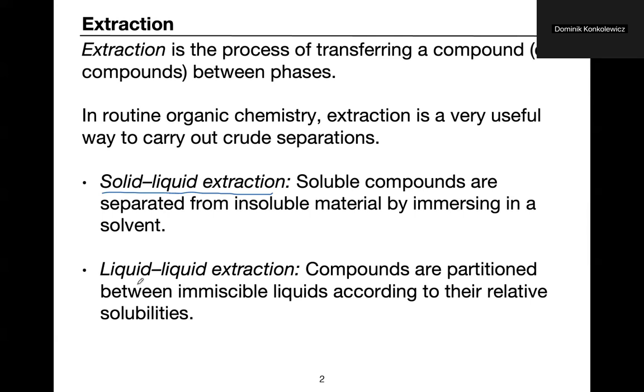No matter how much you try, if you take some kind of oil, so olive oil, or canola oil, or butter, or any other oil type product, and you try to mix it with water, it just won't mix, okay, because they're immiscible. In that case, we have two liquid phases that are distinct, an oil phase and a water phase, but they're not miscible. They're both liquids.